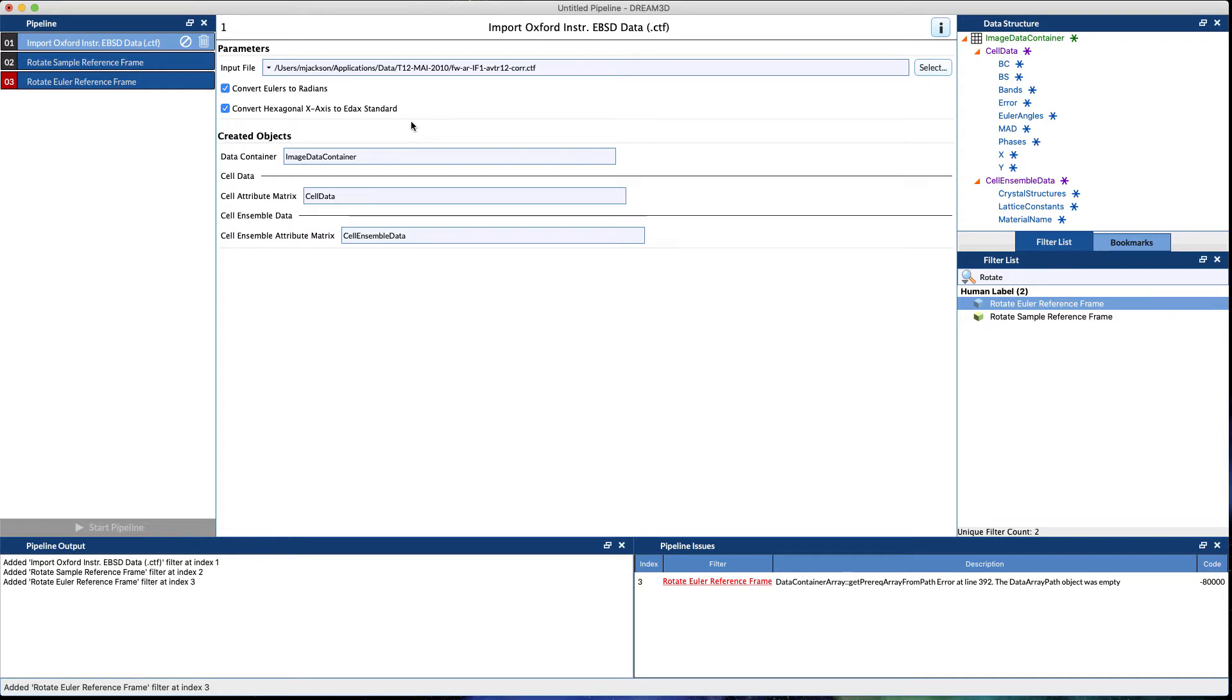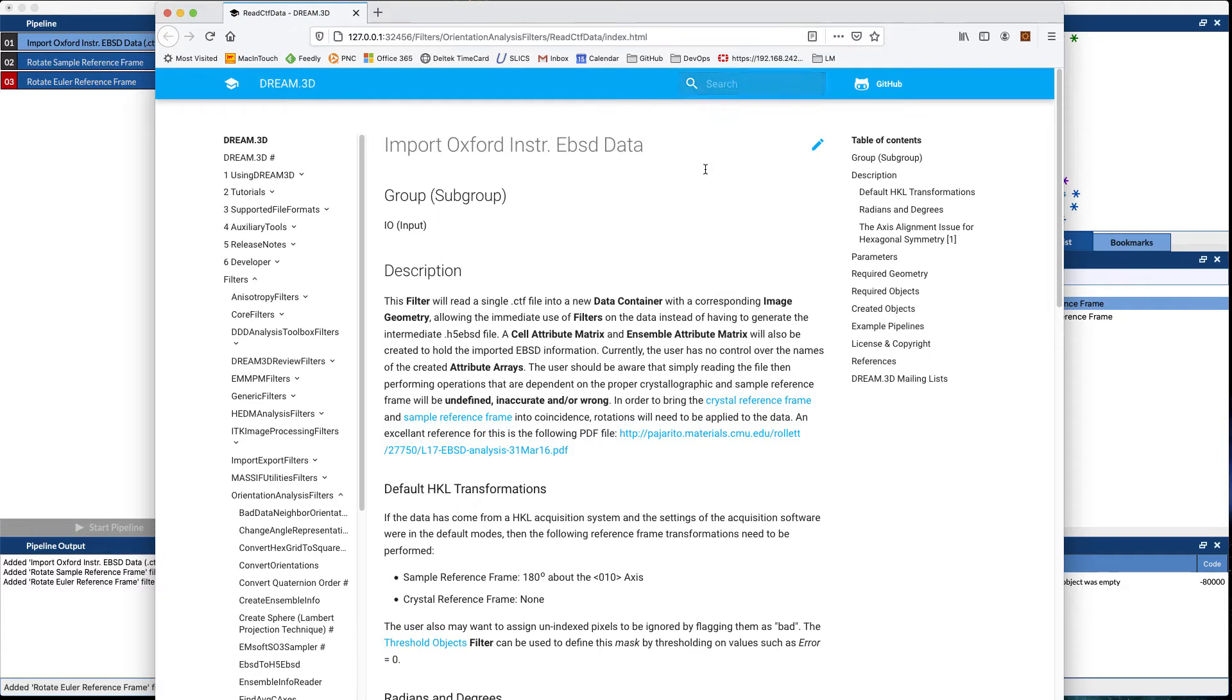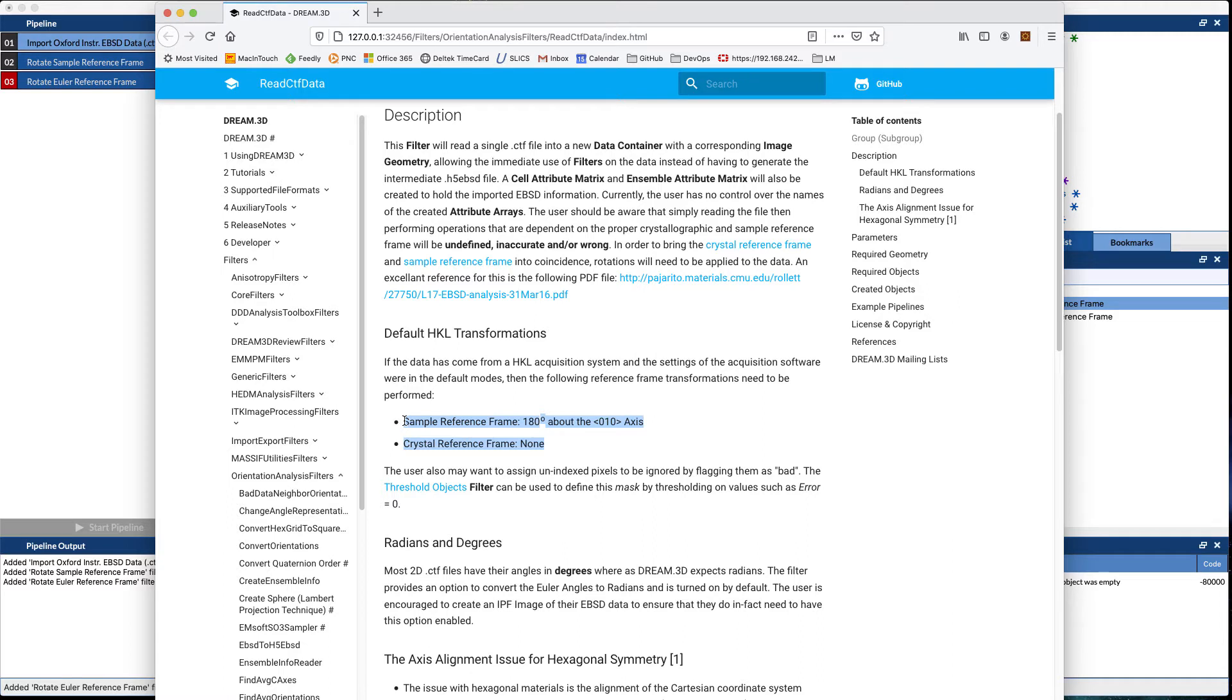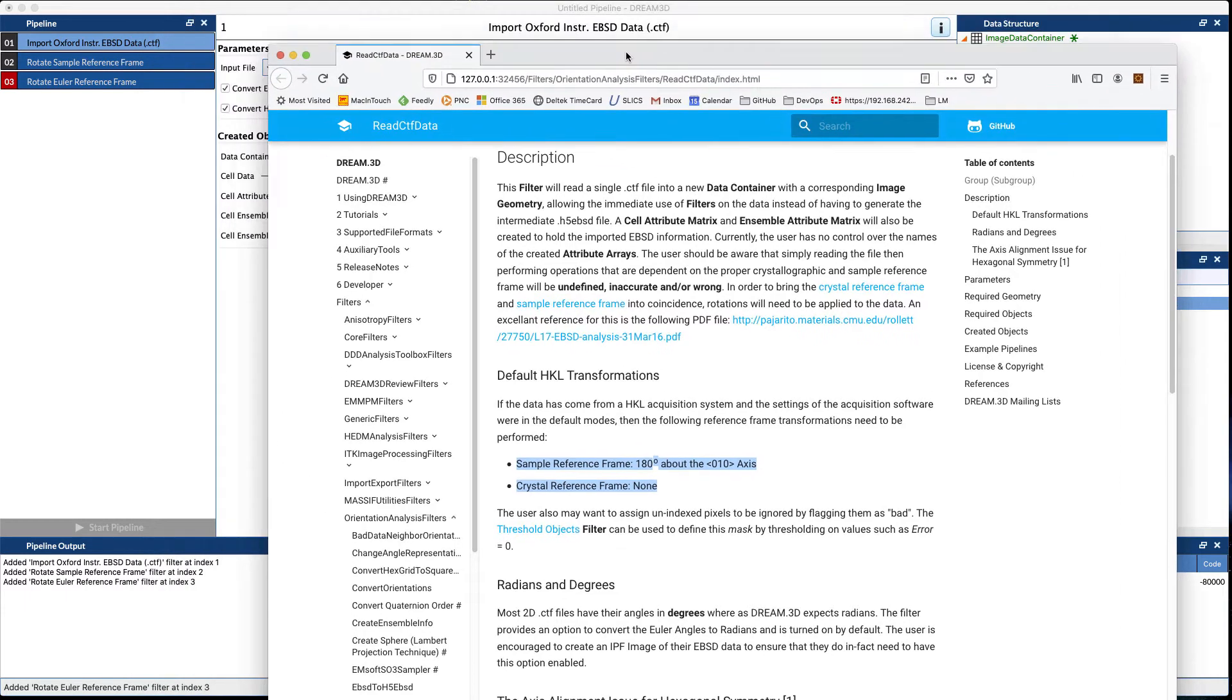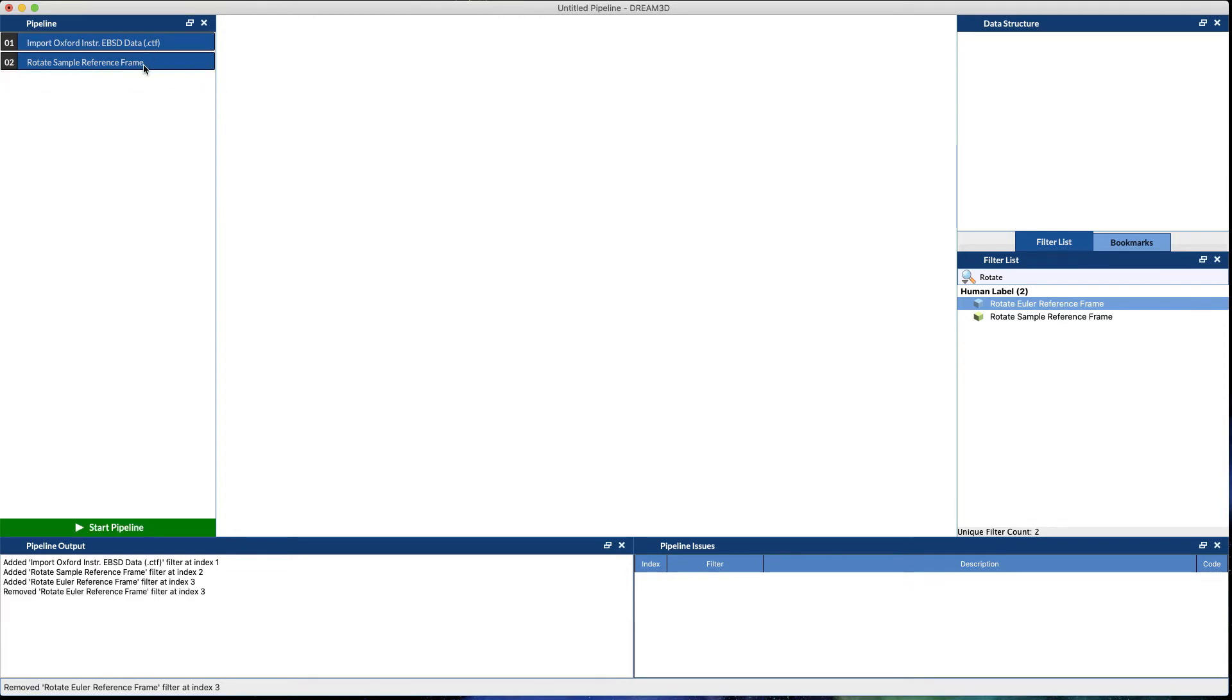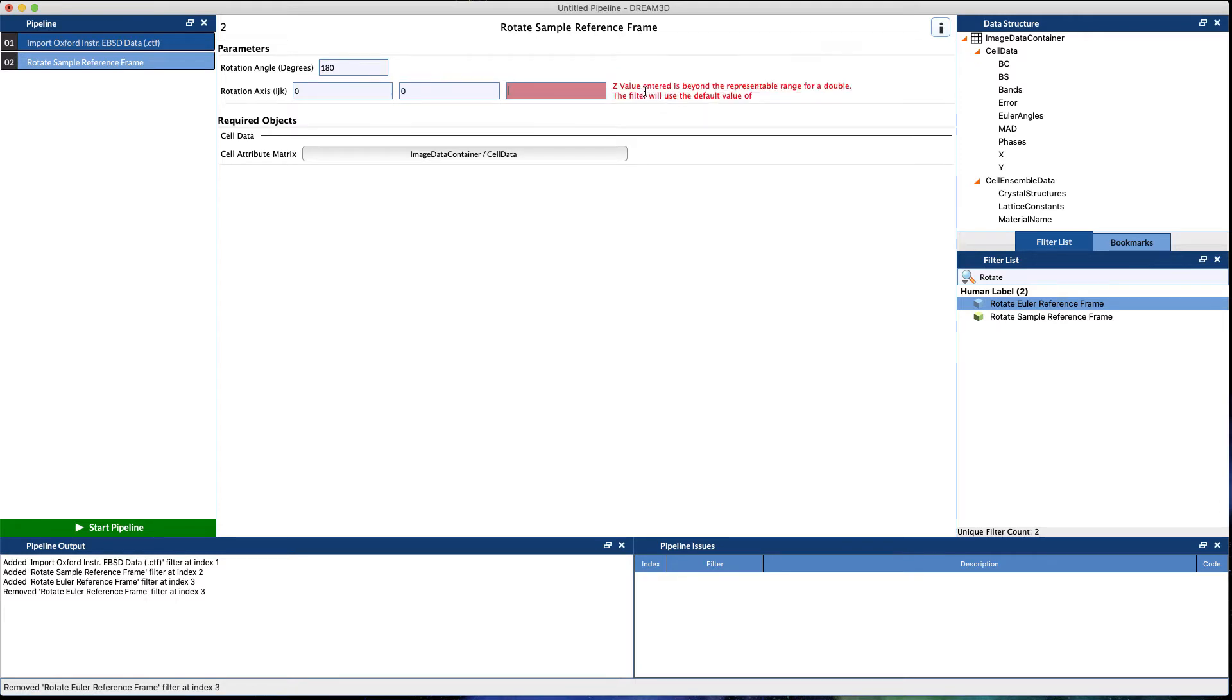It also depends on how your EBSD system is set up. By default, if you go to the help for each file, we will give you what has typically been done in the past. You should check with your EBSD technician or your EBSD vendor to ensure that these would be the correct transformations. For Oxford Instruments data, they don't need a crystal reference frame rotation, but we do need a sample reference frame of 180 degrees about the 010 axis.